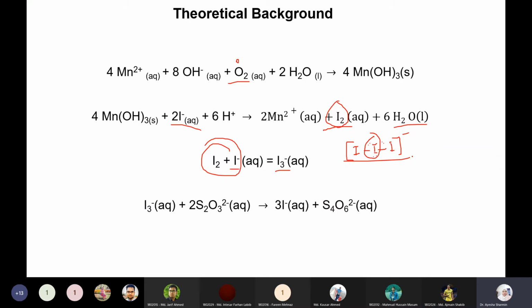So you can see the I3 minus, the iodine actually comes in the reaction. I minus doesn't react with the thiosulfate. It reacts with the thiosulfate and produces potassium iodide, the iodide again, the reduced form, and the oxidized form, tetrathionate. So that's the total reaction.